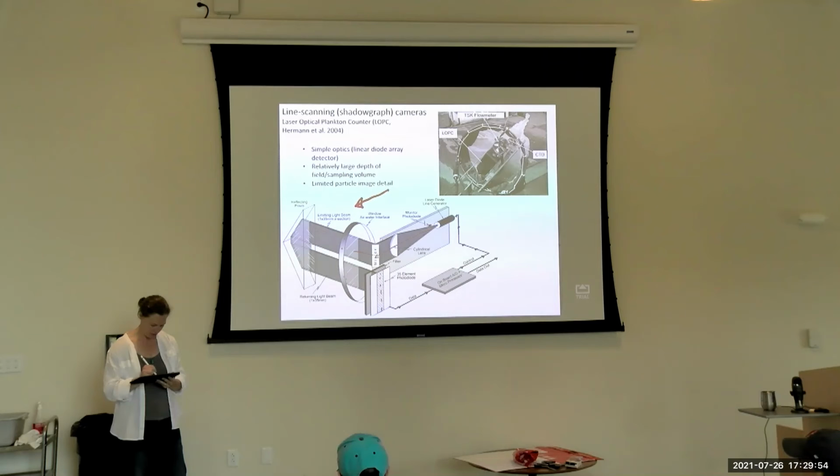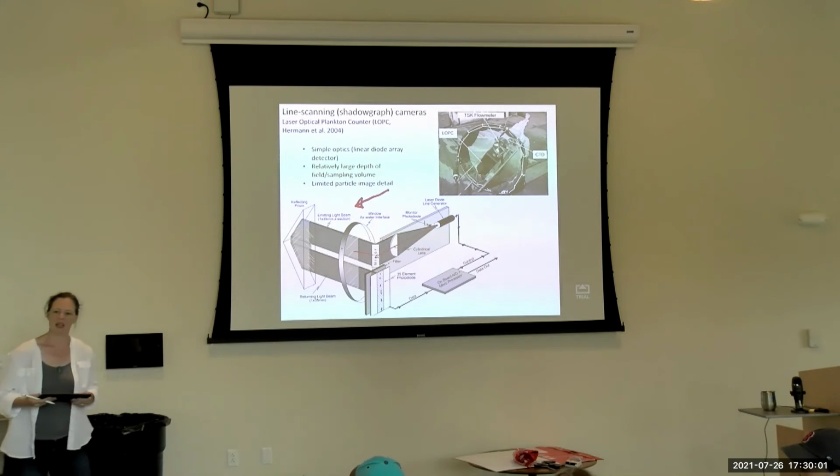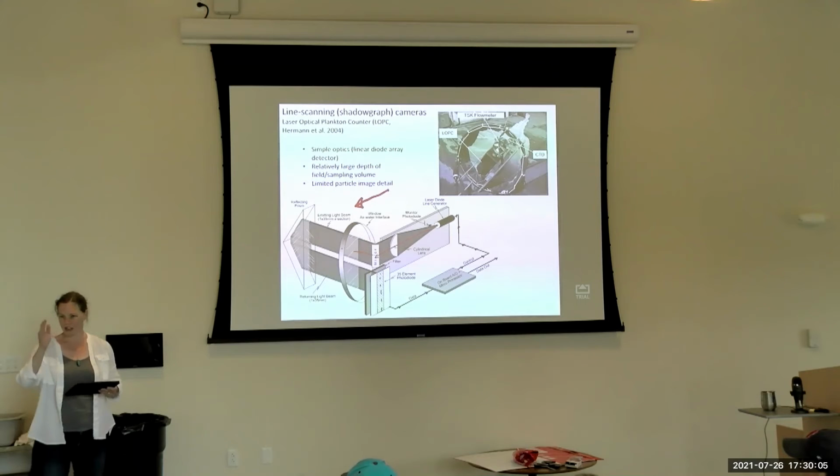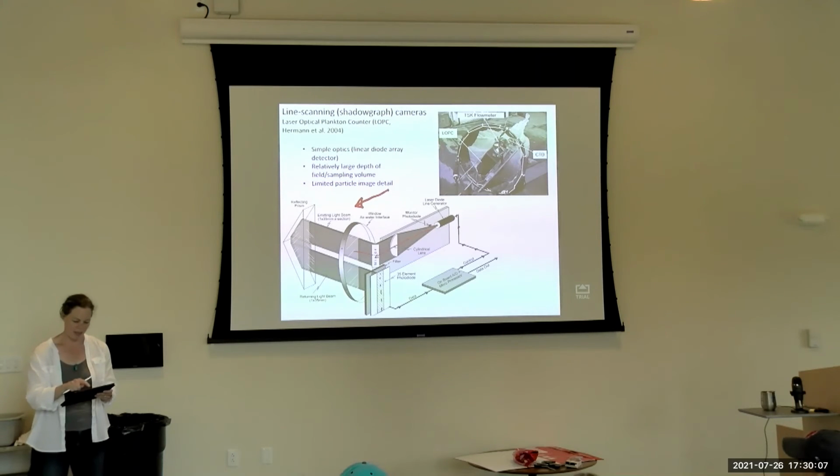No, I was just wondering. Yeah, I could see one depth, have it go through both so that you got more volume going through or something. But as you can see, I'll show you on the next slide, the illustration will kind of clarify. I don't think you want two particles essentially occluding one pixel.